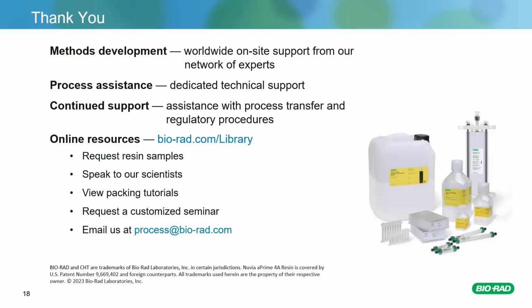Yeah, that's a very good question. So, firstly, be aware that this might be very product specific, and even the same molecule type might have a different range of significant factors. It is important to note that the factors are different depending on whether bind and elute or flow-through mode is used.